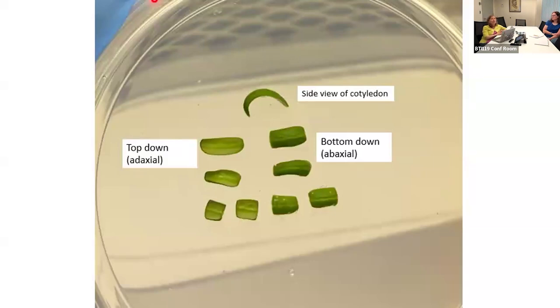Speaking of, I was just thinking, sorry, Amy. There was one question that came in through email where somebody asked about uneven germination of their tomato seeds. We haven't had to try this, but I have heard that some people will soak them in water overnight, kind of imbibe them for a while.